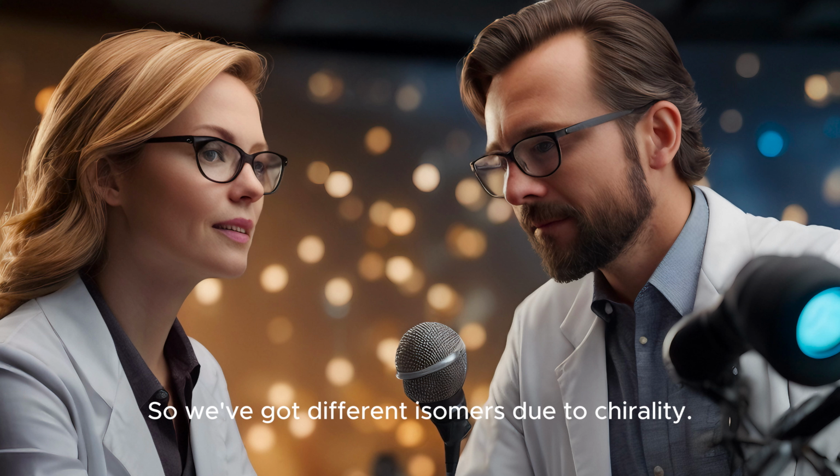So we've got different isomers due to chirality, and then on top of that, we have the different tacticities. No wonder separating these various forms of polystyrene is such a challenge. It's like trying to sort a mountain of Legos, not just by color, but also by how they're connected. And that's where Sweeney, Wong, and Shalliker come in.